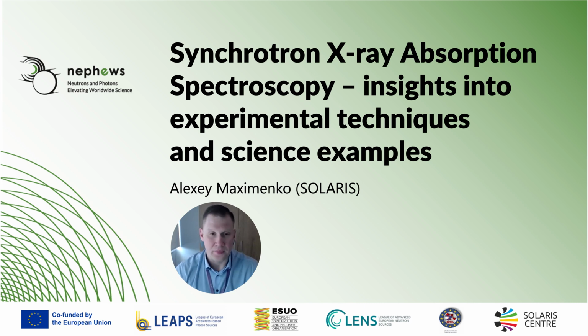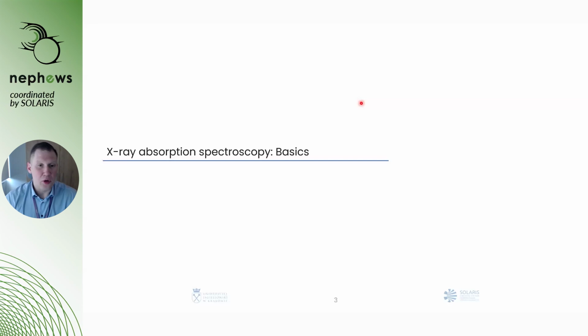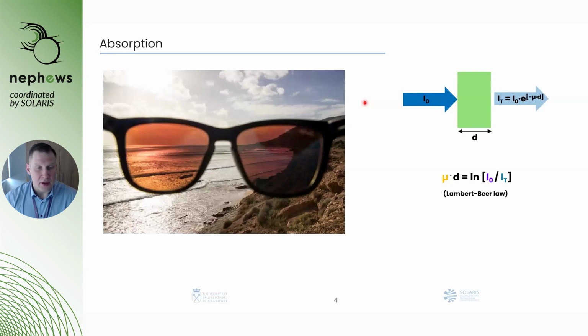research in the future. In order to introduce you to the world of X-ray absorption spectroscopy, let's speak about the basics. If we speak about X-ray absorption spectroscopy, we need to understand what absorption means by itself.